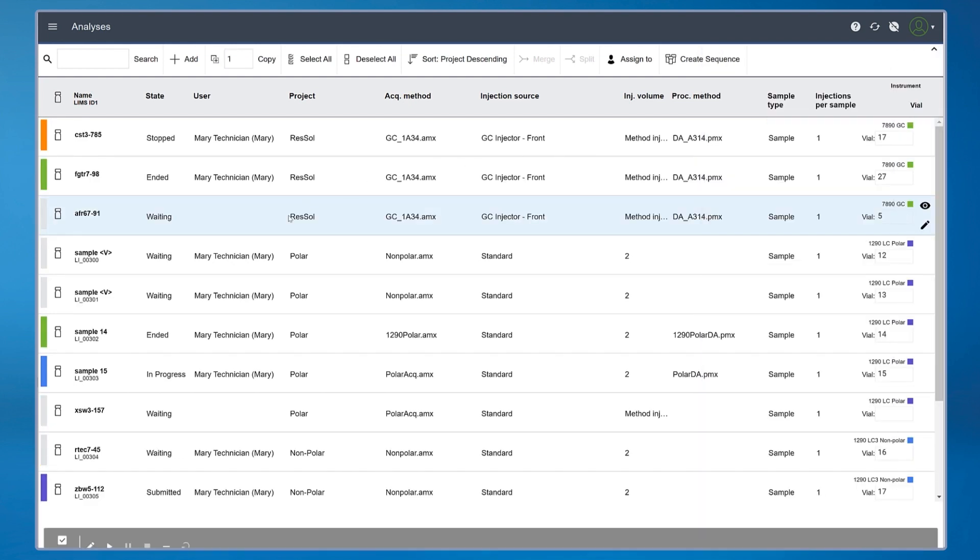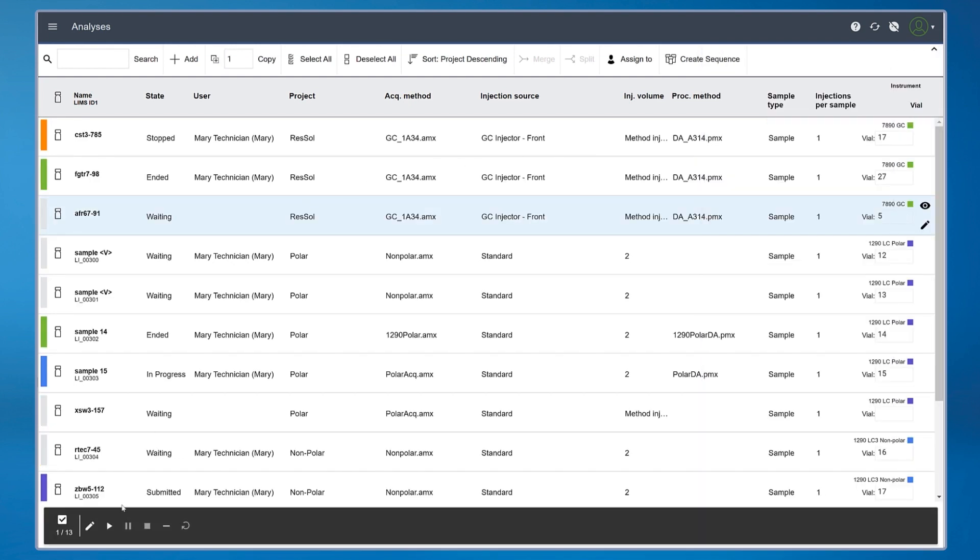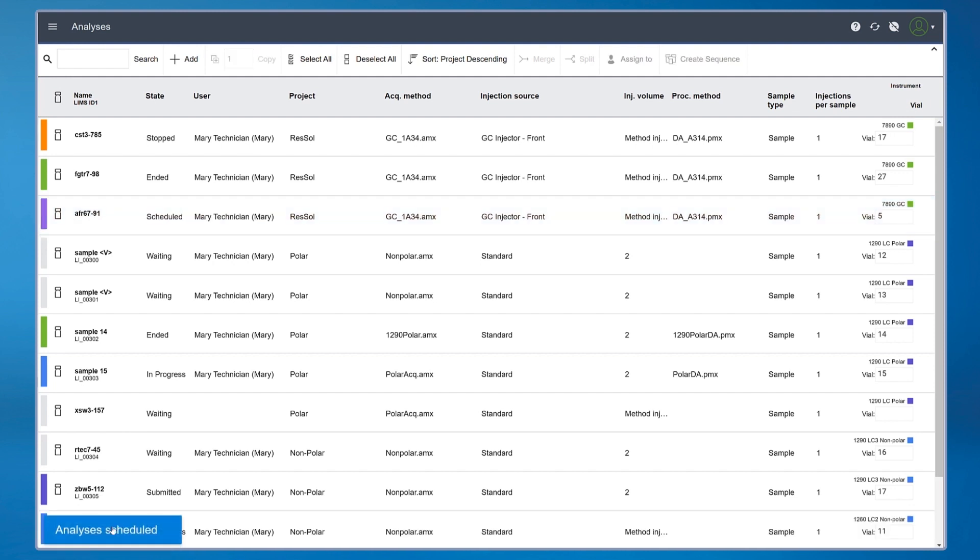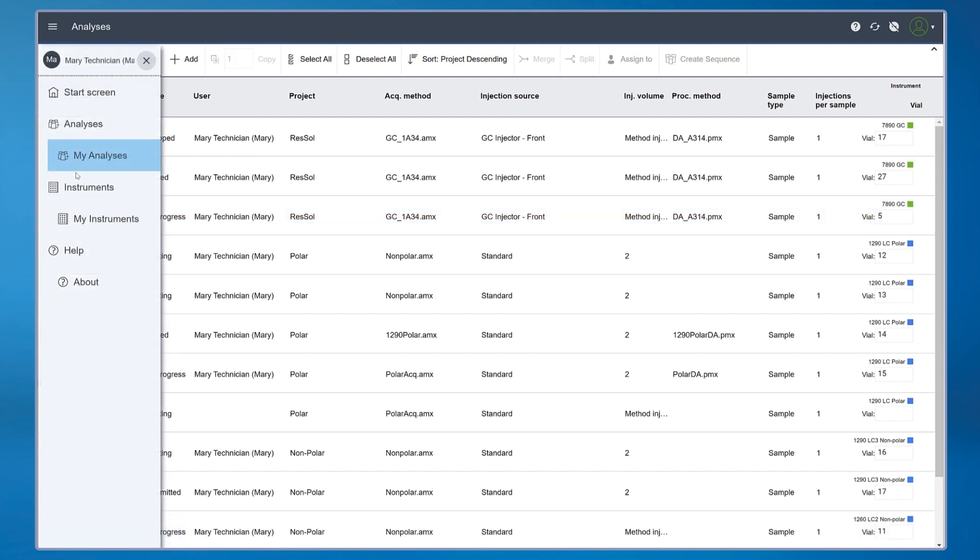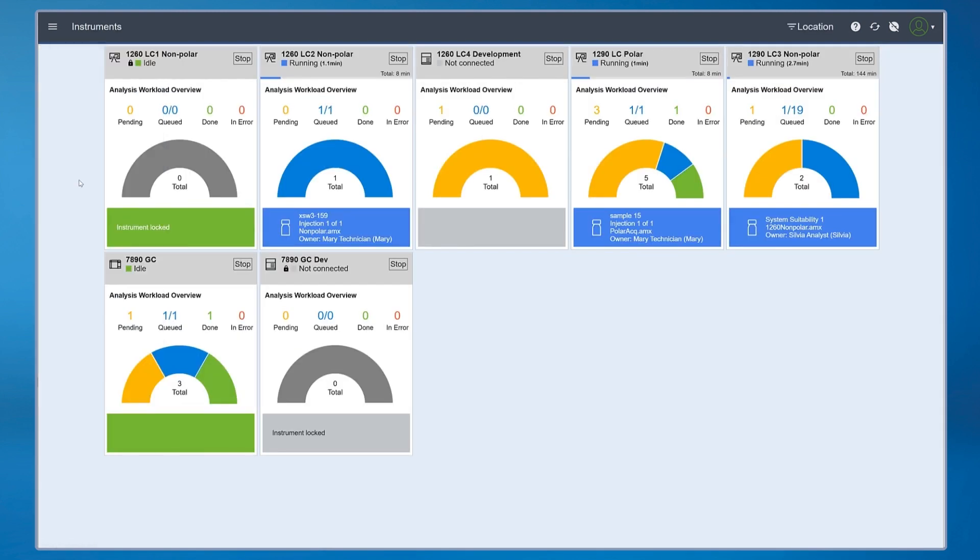Want to submit samples to an idle GC? Sample Scheduler gives you a lab-wide view of all the instruments.